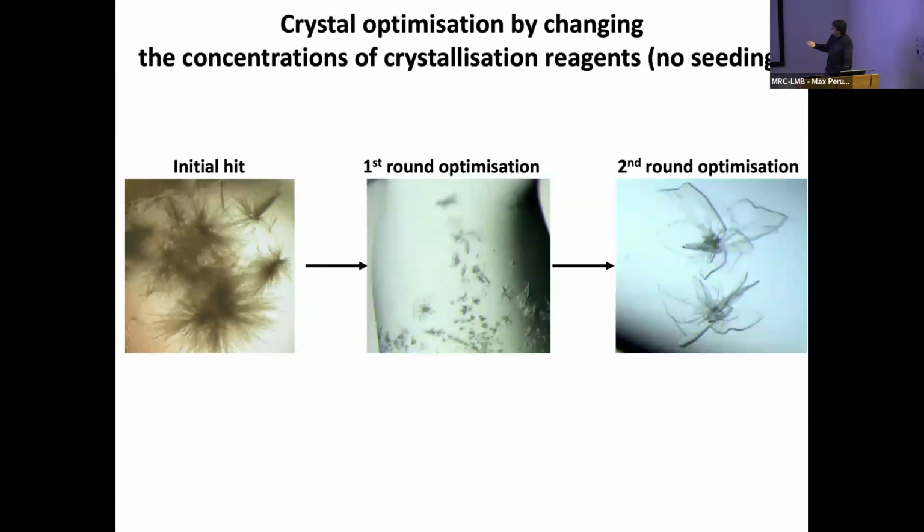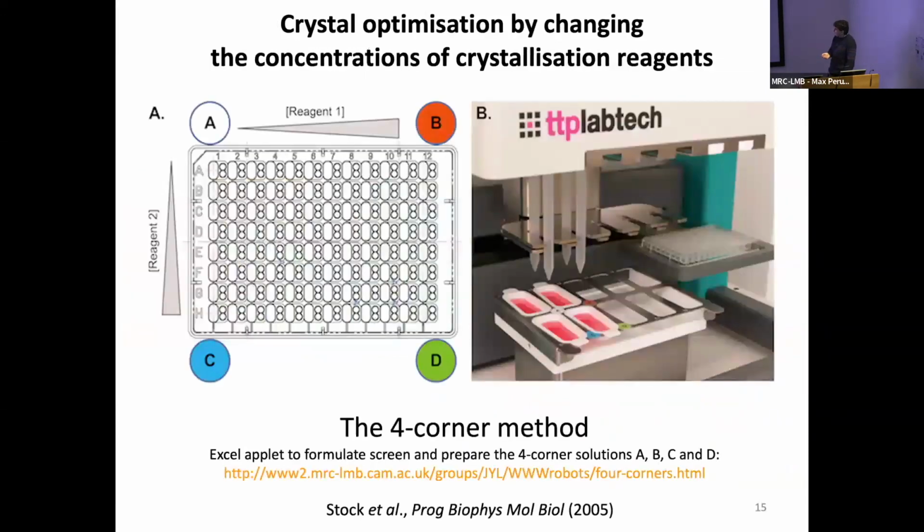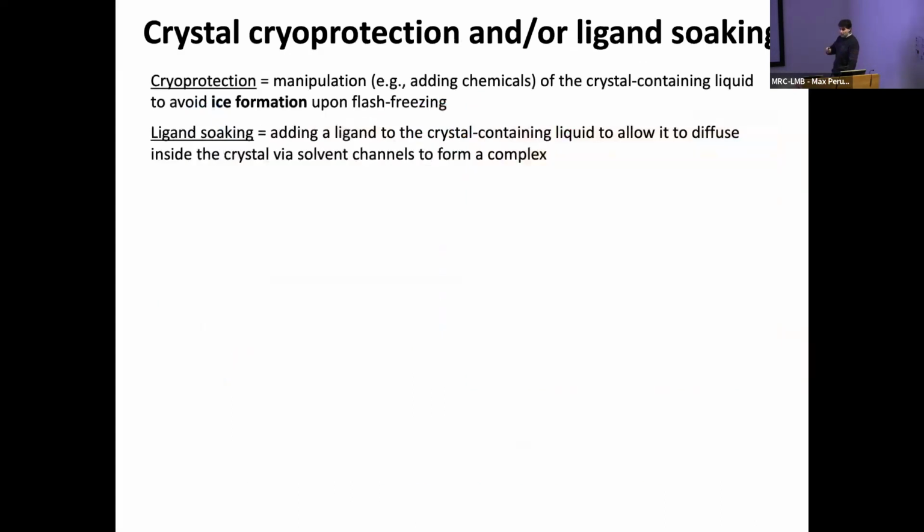And to do the crystallization optimization, this is a slide from Fabrice. We have this nice dragonfly robot, which we can talk to Fabrice about. It's very simple to use and very quick. You can easily, quickly set up an optimization around the condition that gave you your initial hits. So I'm going a bit fast because we started a bit late, sorry.